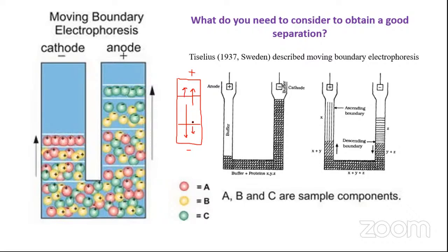That is okay. But what about a negatively charged molecule which is already here? It has to travel this much. It has to pass through the crowd of all those molecules in between. So will it not face a greater amount of friction? Yes, sir. Right? So can you get rid of this situation?